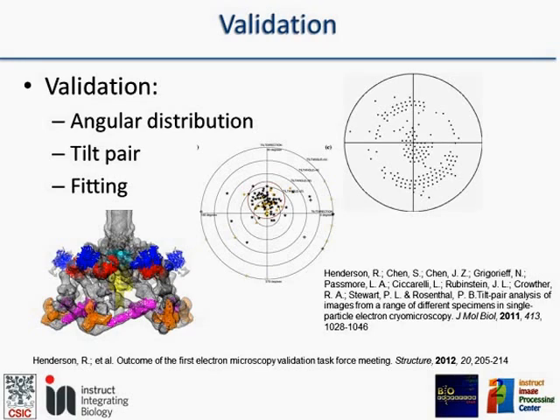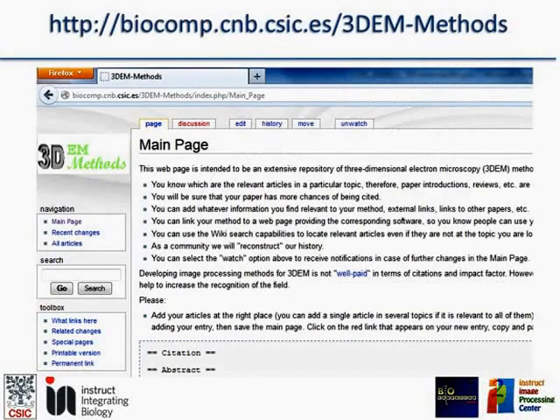So you may try to change something in your analysis so that you get a model that better fits your expectations with respect to the atomic structure. For instance, this is particularly important if you claim to have a resolution between 5, 6, 7 angströms. There you should see secondary structure, so the secondary structure elements should be consistent with your EM reconstruction.